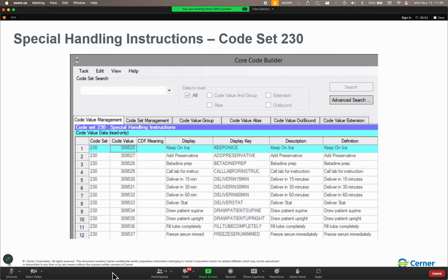All right. So then let's talk about specimen containers. So folks, we can build specimen containers in specimencontainers.exe, or we can build them in Bedrock. Either way works. When you are building a container, you give it a display, you give it a description, you give it volume units. This could be an each, like our filter paper up here, or it can be in milliliters. There are all kinds of different volume units. And we mark whether it is an aliquot or not.